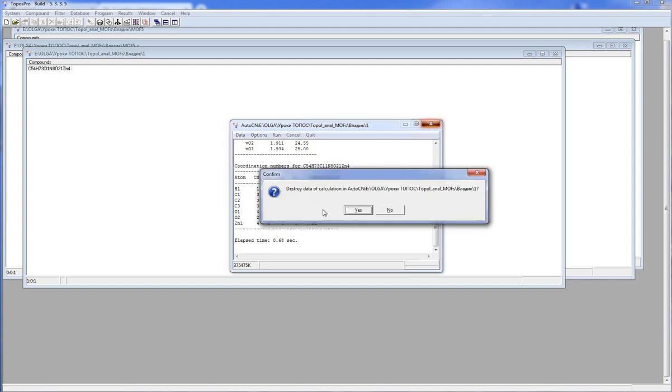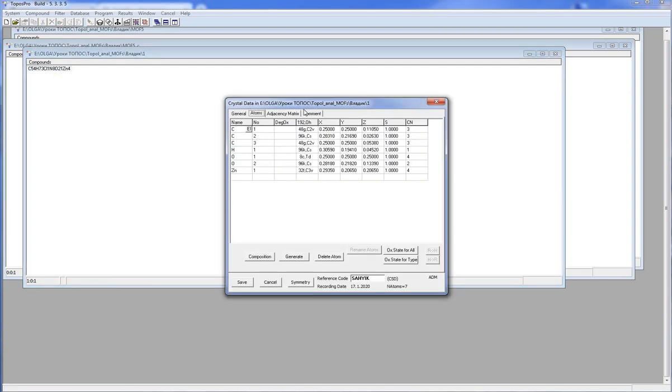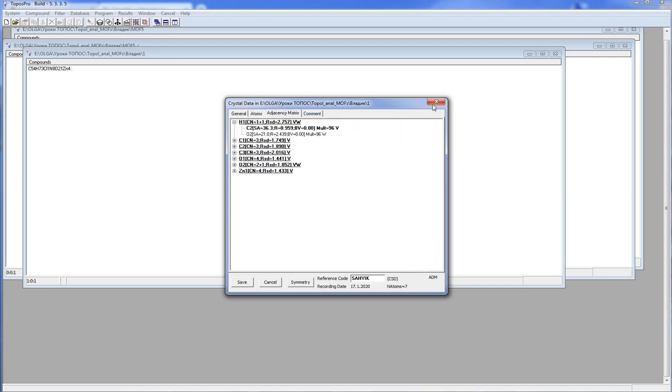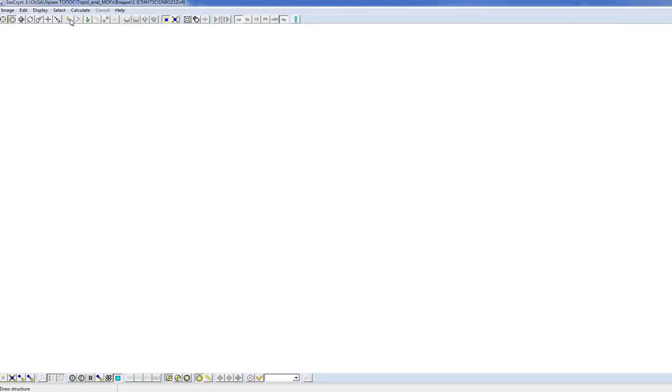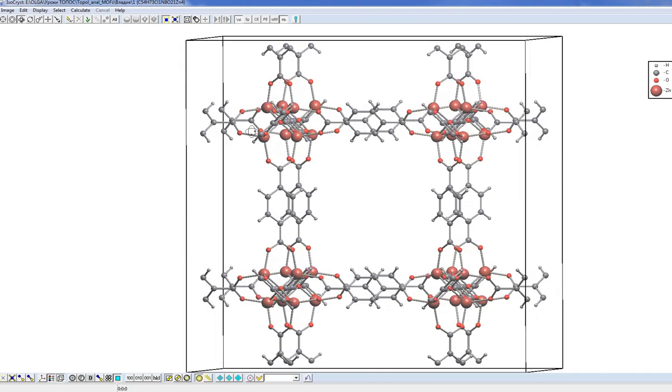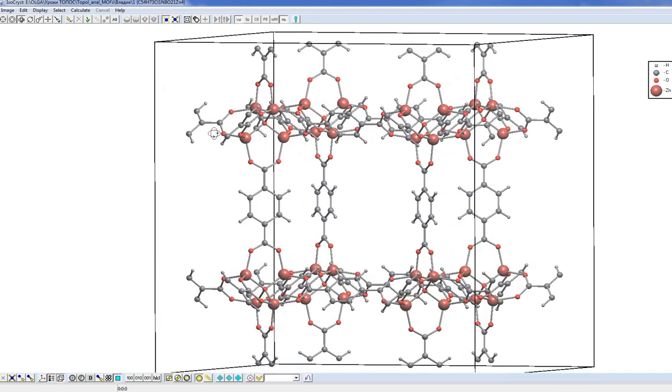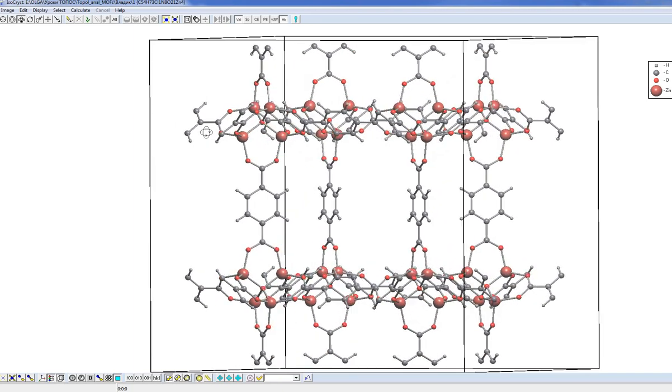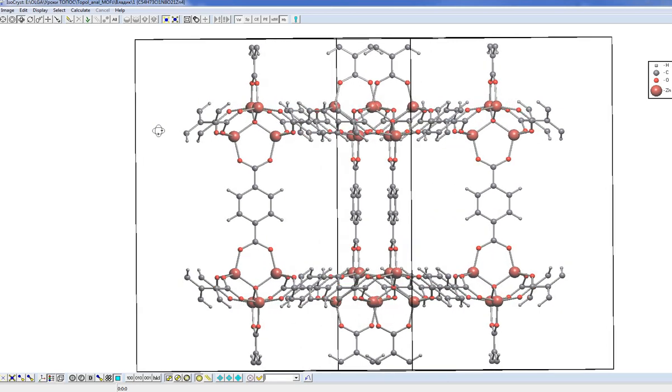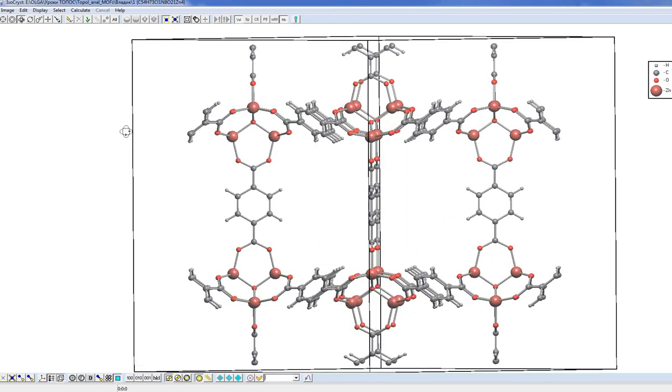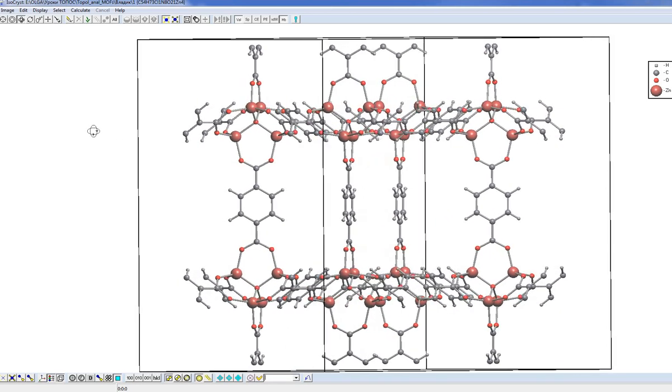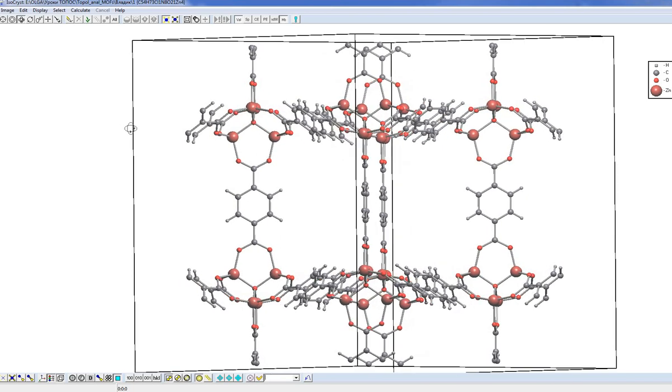Now we have a special tab adjacency matrix where we have complete information about the atoms connectivity. We can look at this structure with the IsoCryst program. This is the complete framework, roughly speaking the complete structure, because we do not consider the interstitial molecules.